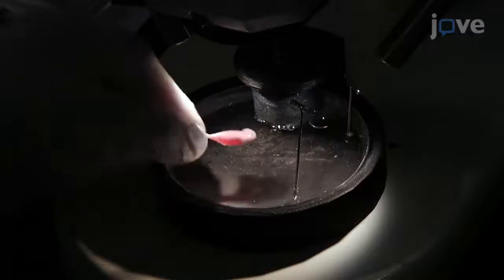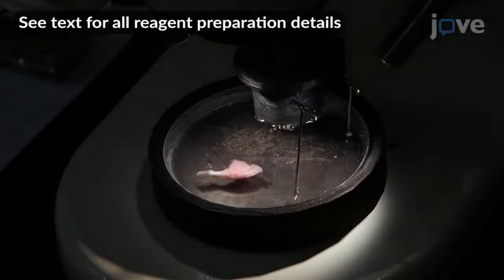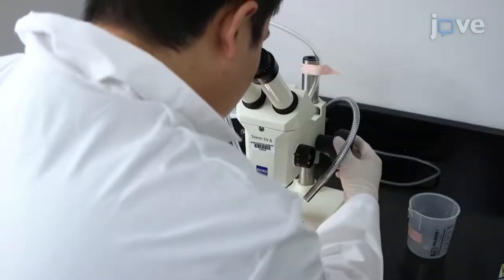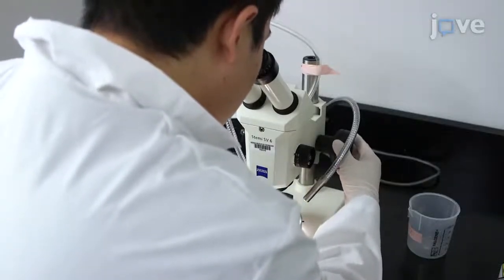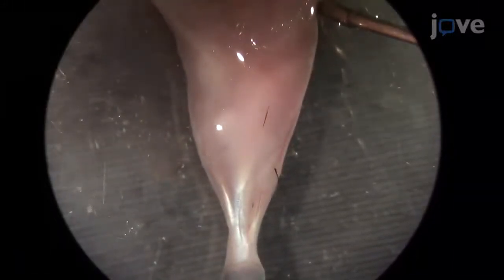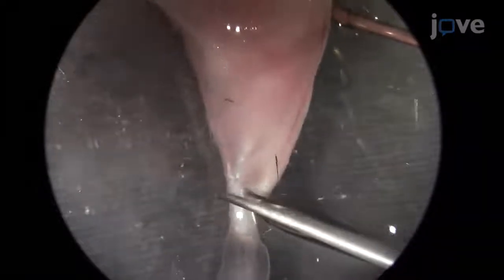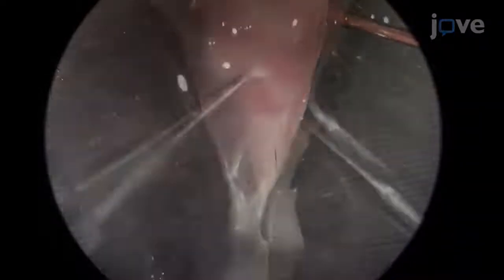Place the limb in an elastomer-coated dissecting dish containing oxygenized wringer solution, and place the dish under a binocular dissecting microscope. To harvest the soleus muscle, pin the hind limb with the gastrocnemius muscle facing upwards. Use fine scissors to cut the distal tendon of the gastrocnemius soleus muscle group, then cut away the fascia on either side.